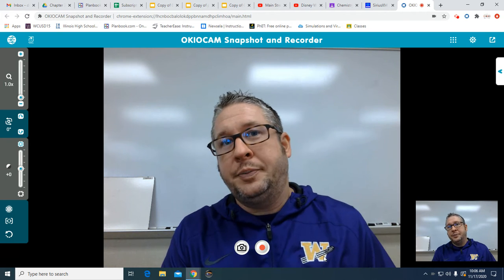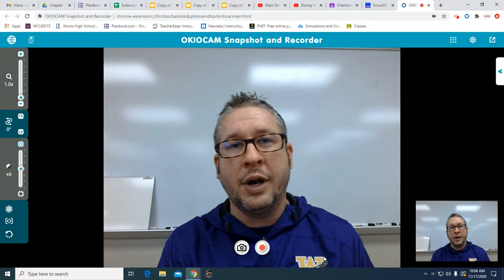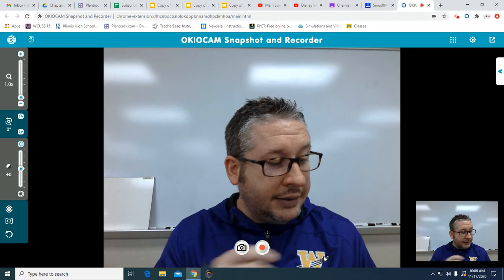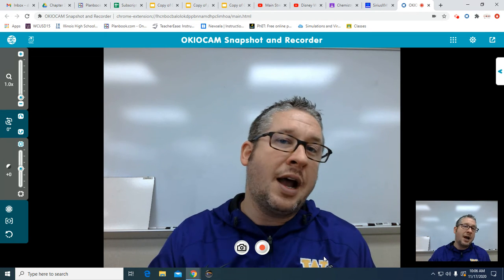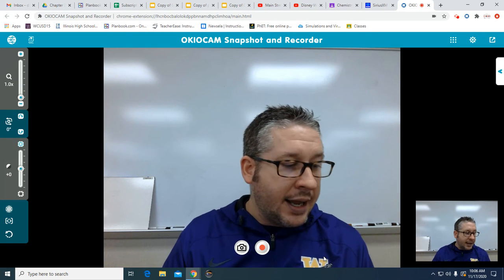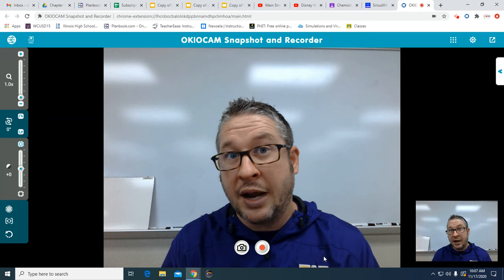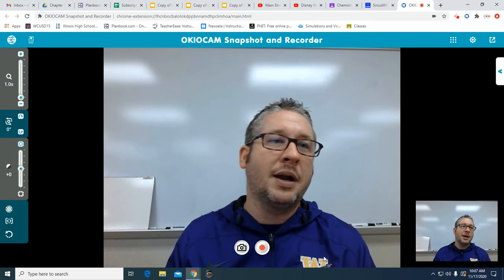Anyway, this is day 2 of the lab that we were doing for mole ratios. Yesterday you saw us put the copper wire in and then measure out how much we started with in terms of copper, how much we ended up with, take the difference of that, and jot down our data table. Today our main goal was to measure out how much silver we actually got after letting it sit nearly 24 hours, as you can see by the time stamp on the bottom right.